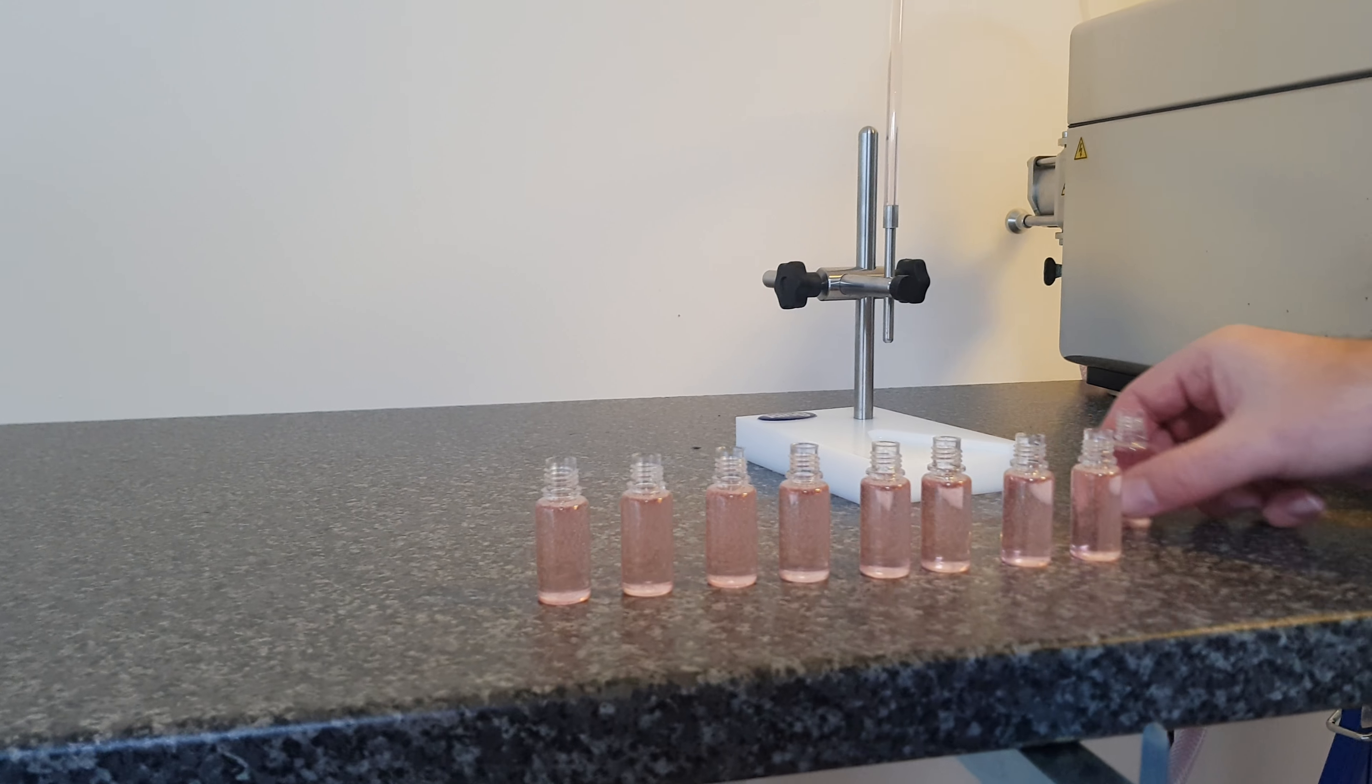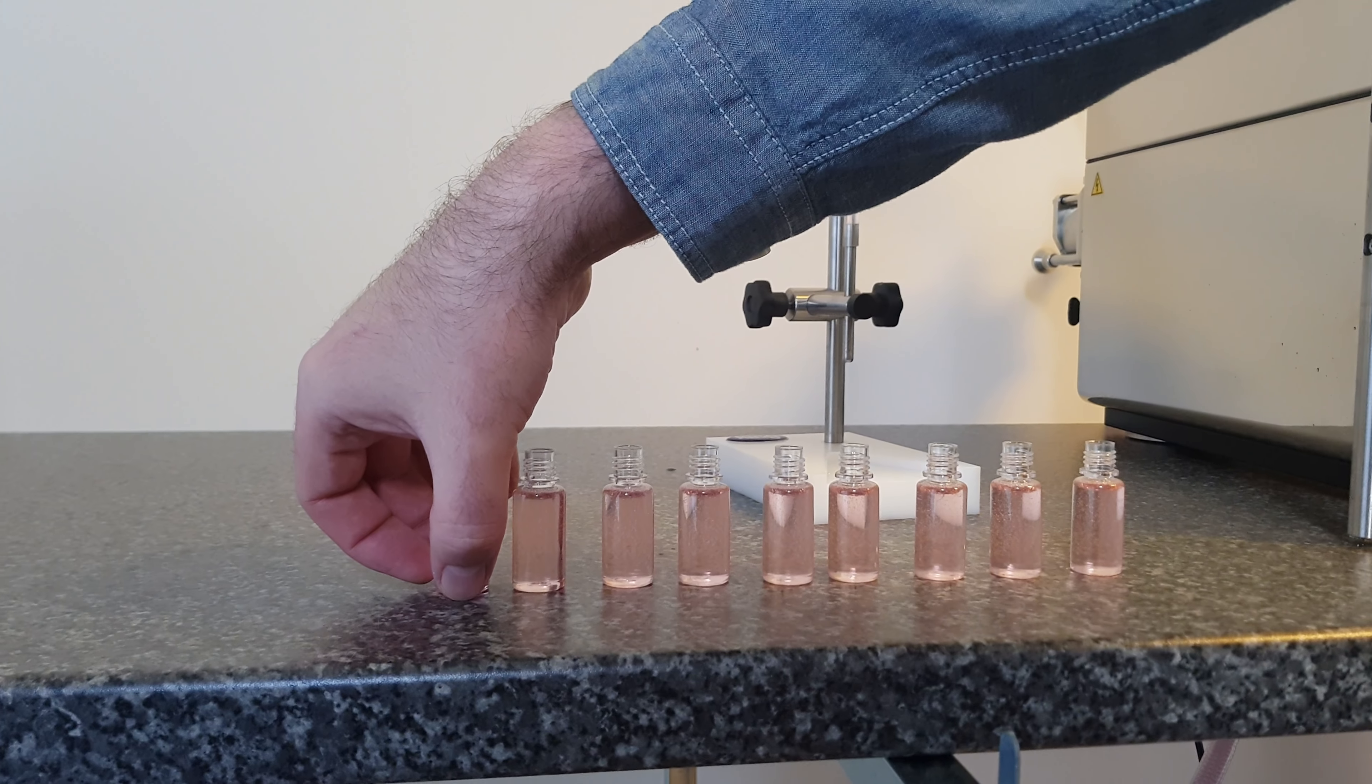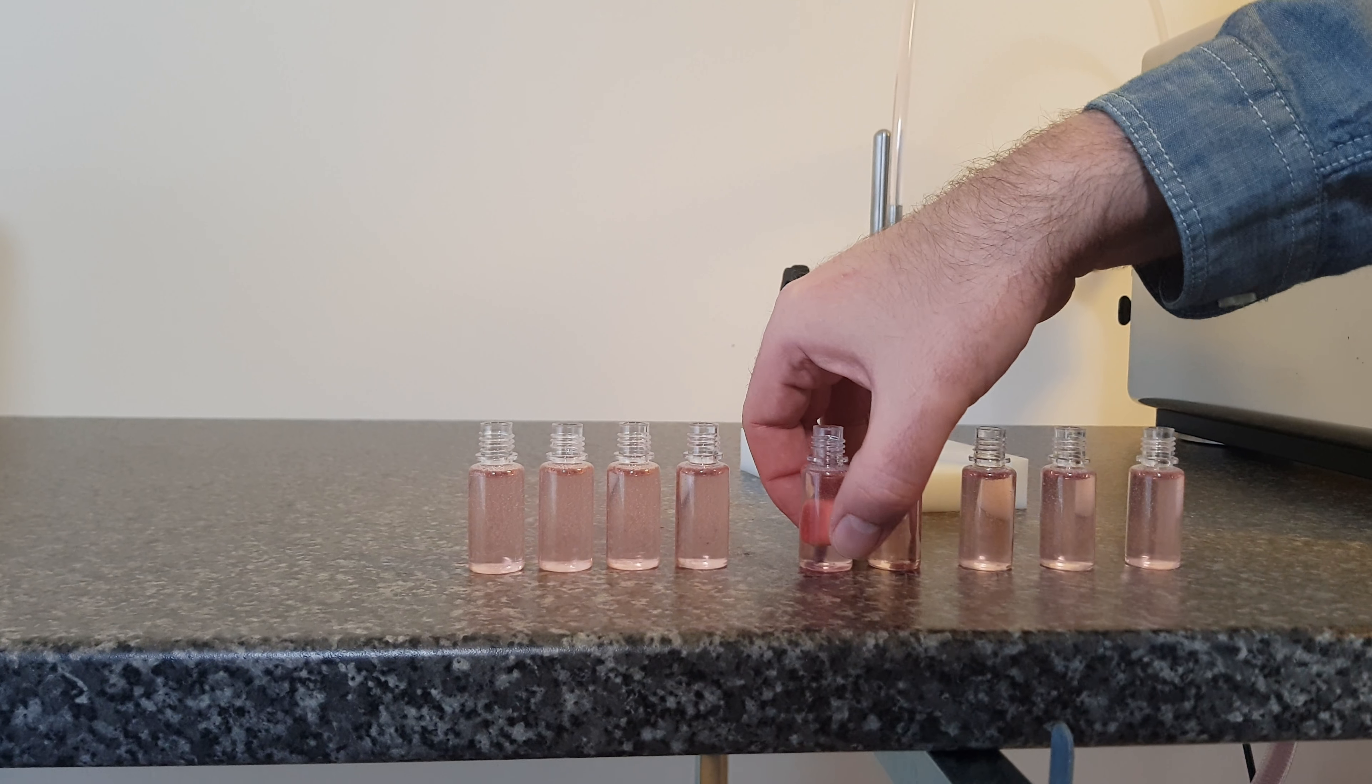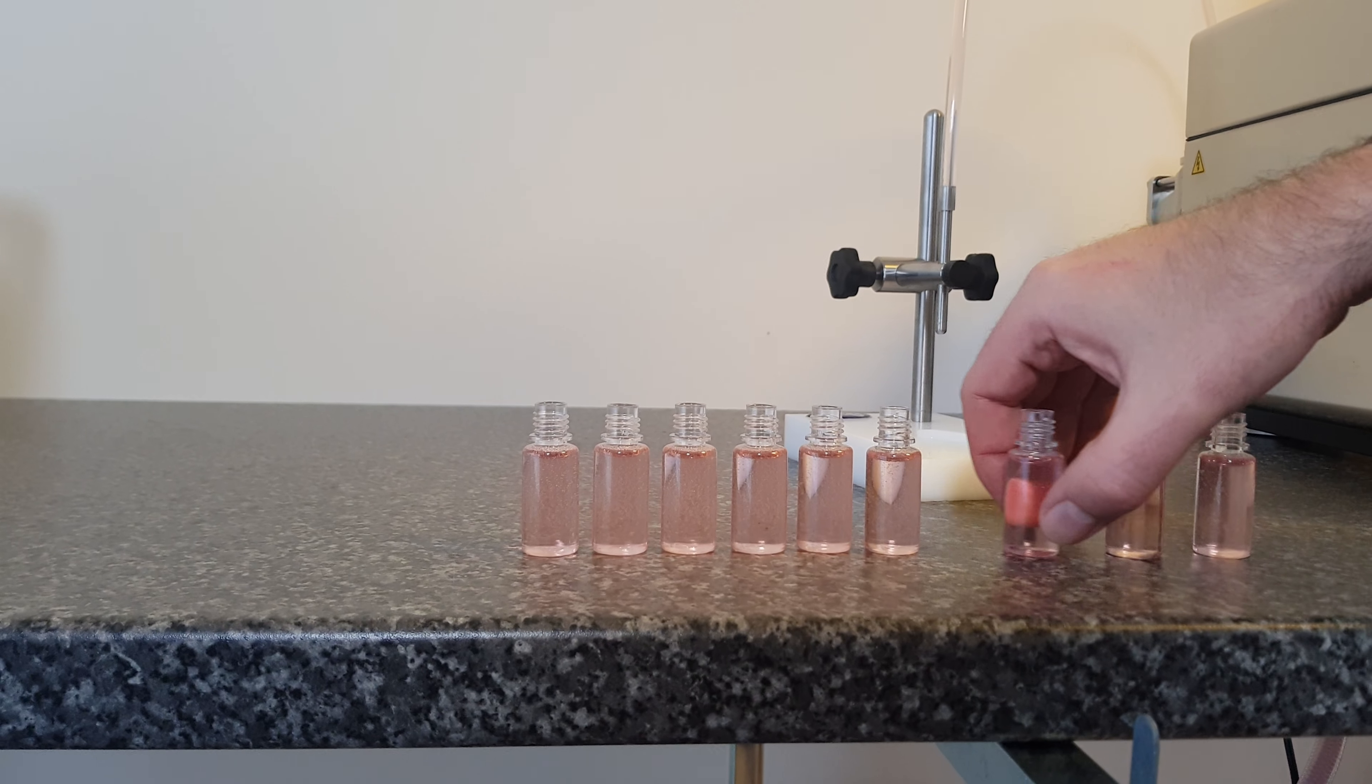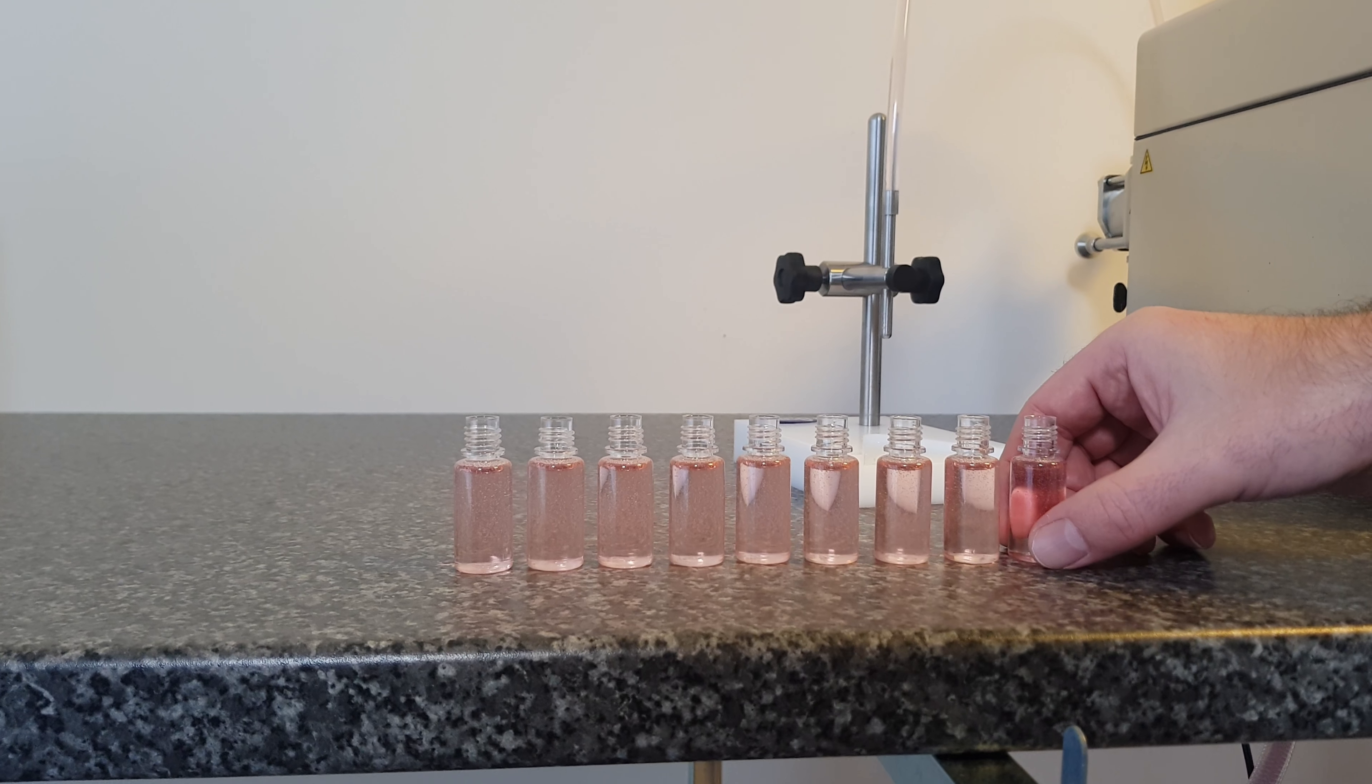The record is one customer managed to do 65 a minute by hand. That's the record. That's on a 10mm fill. I think we're 22 on a 15mm. That's going some.